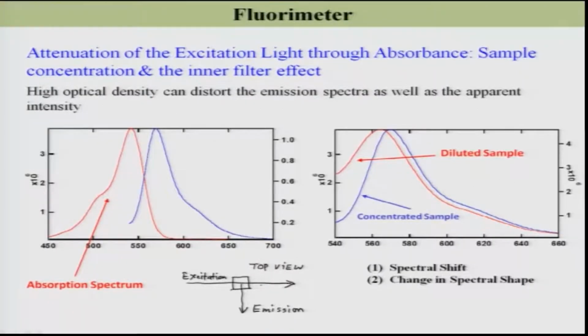Right. So, in this case I am going to collect this emission from the middle side, right, and also please note that we usually use a slit over here and a slit over here to collect this emission, right. This is necessary for the dispersion in the monochromator. So, using this slit, I am going to collect emission only from this region, right.